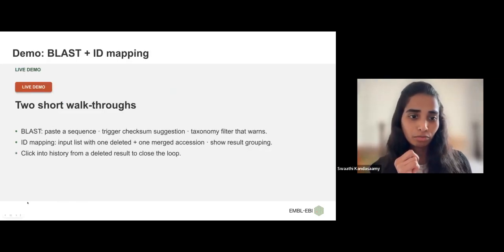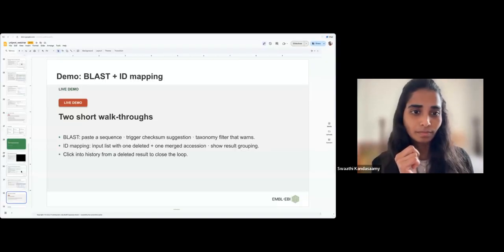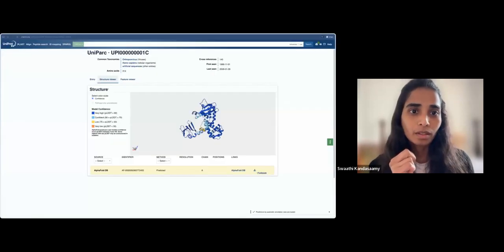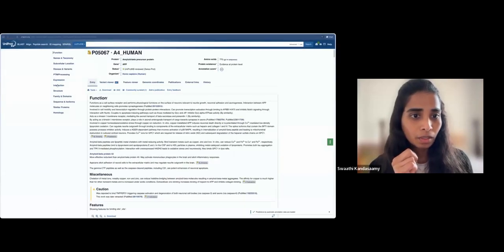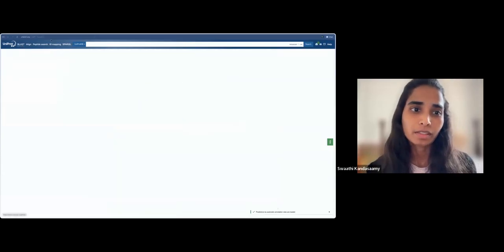Okay, let's go for a short demo. We'll just grab a sequence. I'm going to BLAST with this sequence now.